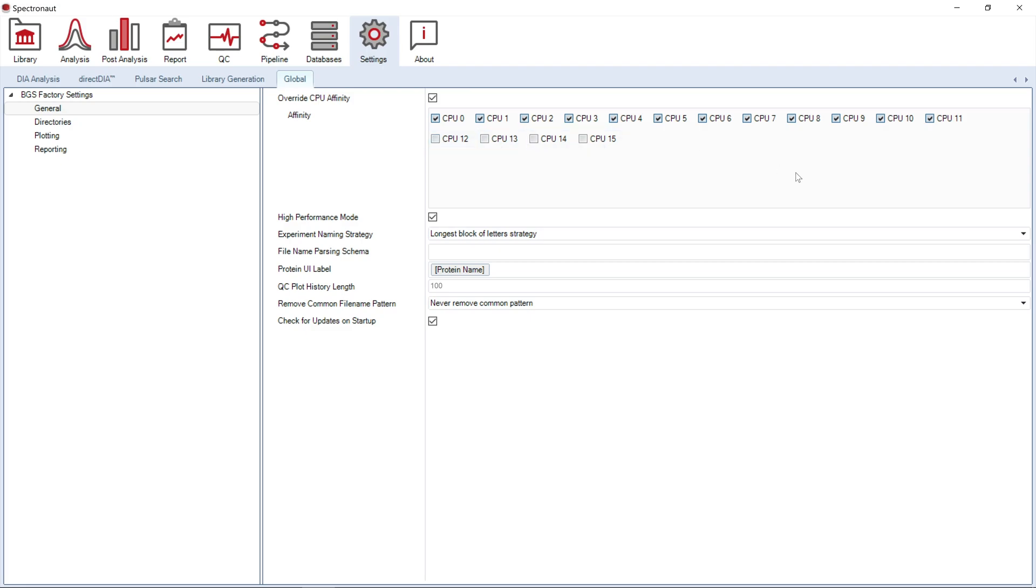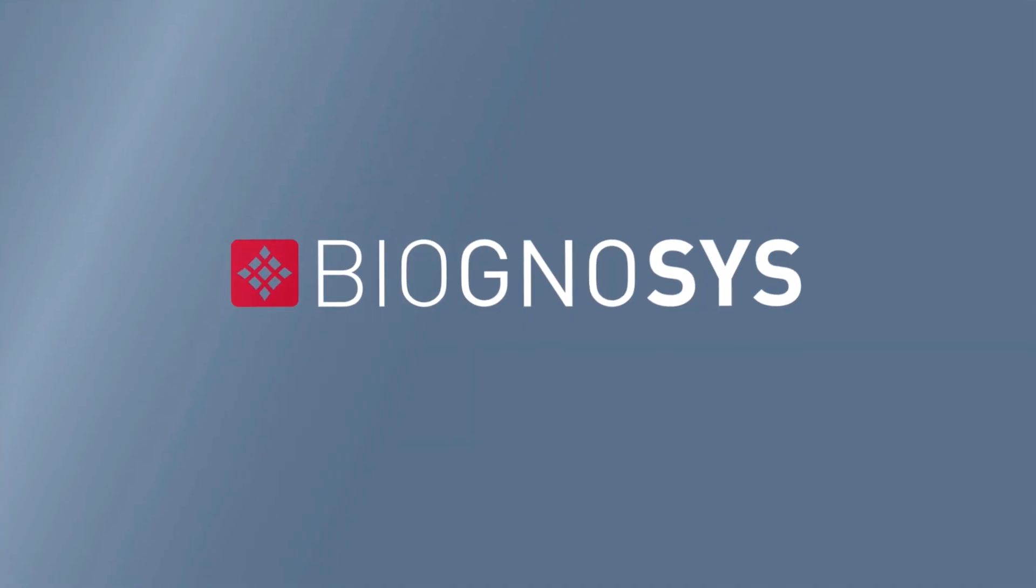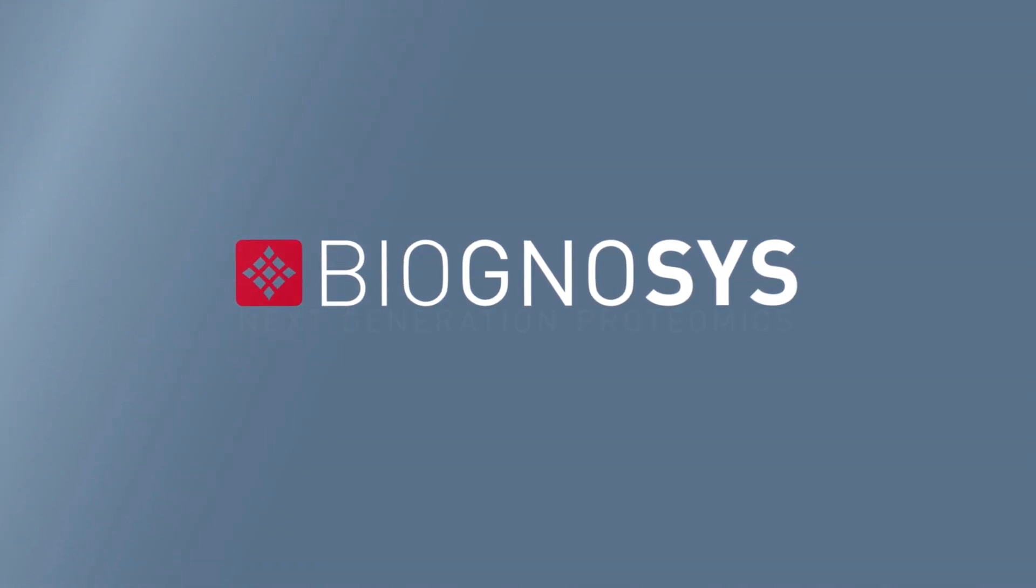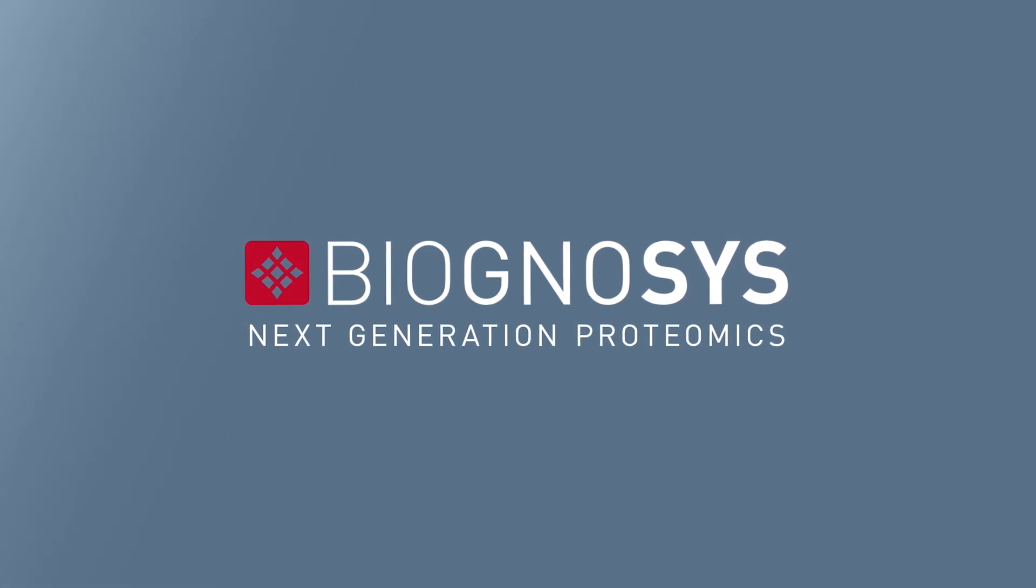Restart the software and you are all set to start your first Spectronaut analysis.